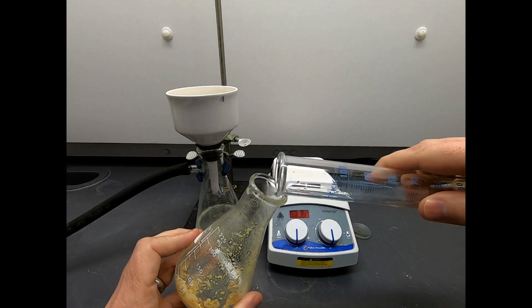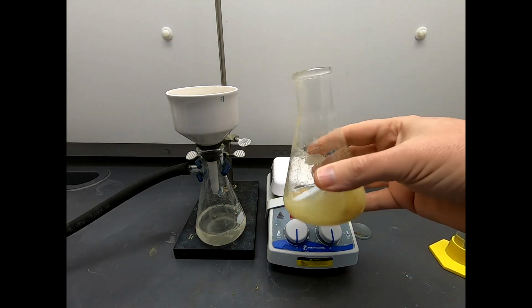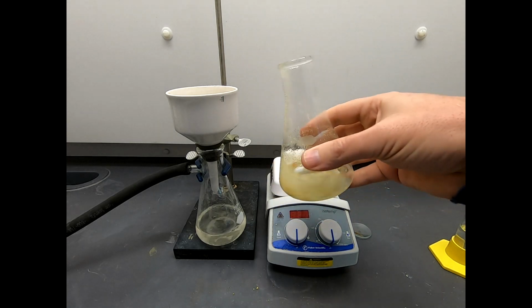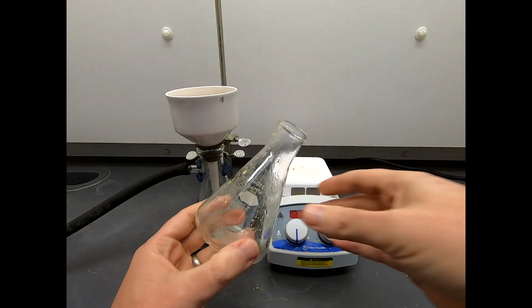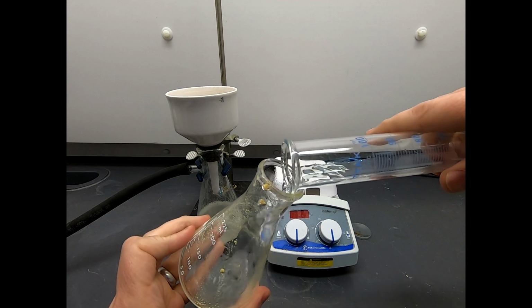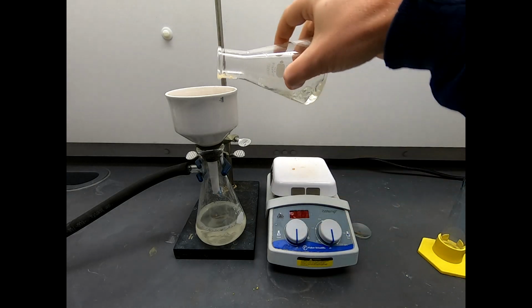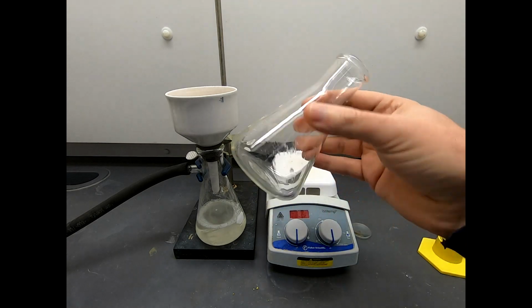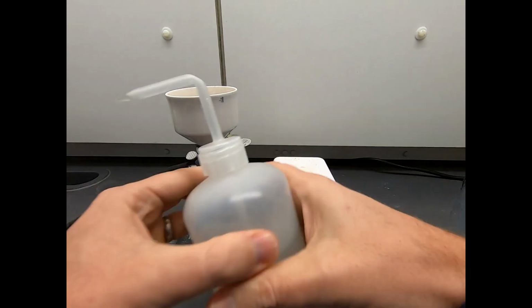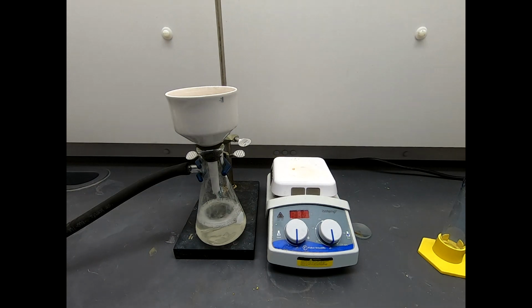Now let's give this a little more water. I'm not gonna be patient enough to avoid the stir bar. We're just gonna dump everything in. The more firmly and quickly you pour it, the more you transfer the solid, but that means you're gonna dump the stir bar. You can always use a stir bar remover, but I don't have one in reach, and that's how it goes. Okay, that's not perfect, but that's good enough for what we need. Let's just spray this down a little bit more, and I will show you what this looks like in the funnel.